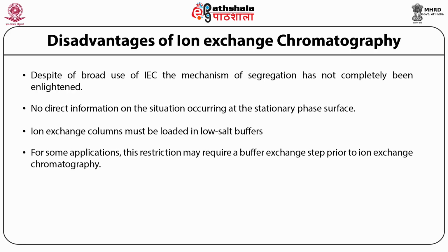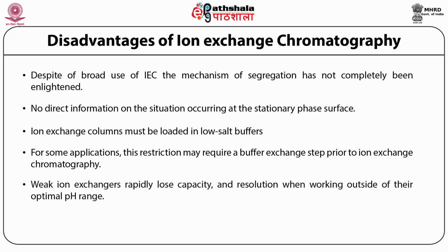For some applications, this restriction may require a buffer exchange step prior to IEC. Weak ion exchangers highly depend on pH, and these resins rapidly lose capacity and resolution when working outside of their optimal pH range, which is a limitation of ion exchange chromatography.